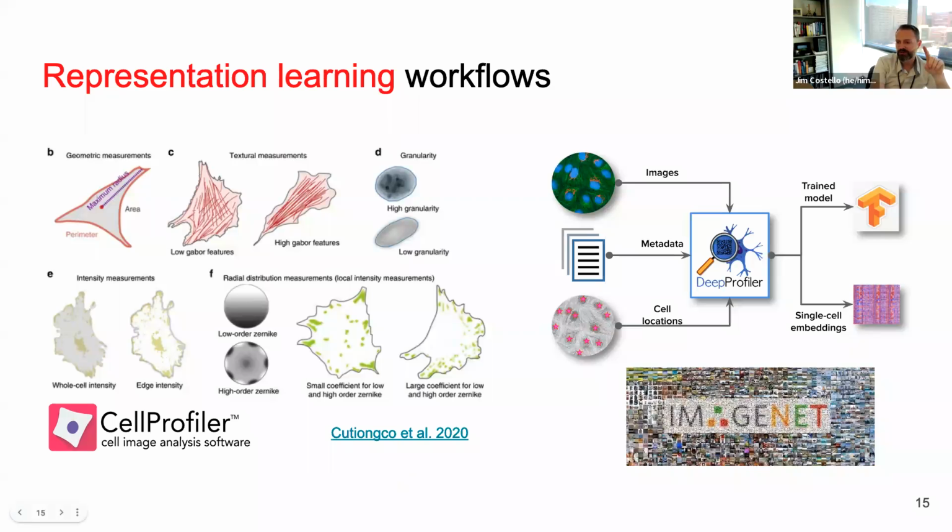Sorry, do you mind if I ask a question? Please, go ahead. You might be talking about this in a little bit, but I'm curious how good the prediction is across different cell lines, in particular ones with pretty significant morphological differences. What do you mean predictions? Well, identification of features, right? How does the quantification look across more mesenchymal, spindly cells versus more cuboidal ones? I'm assuming those were in the training model. I'm just curious how the actual biology of the cell affects that.